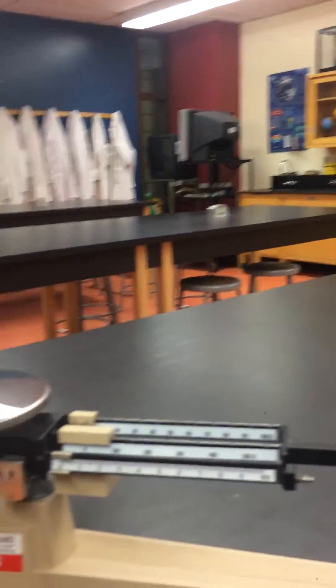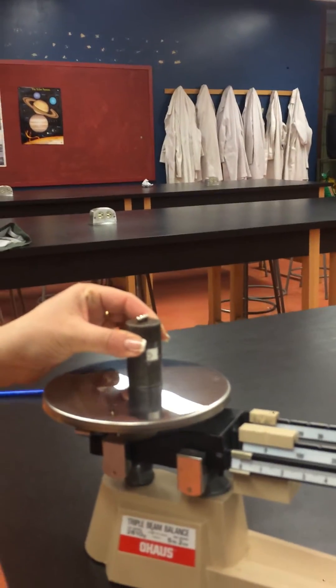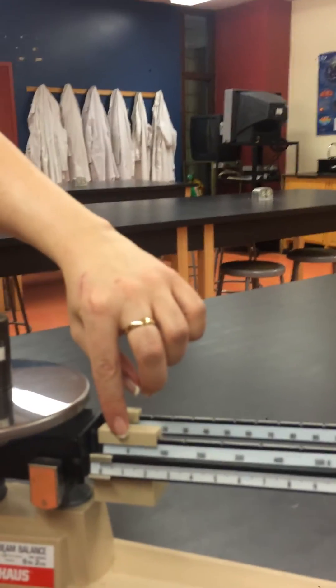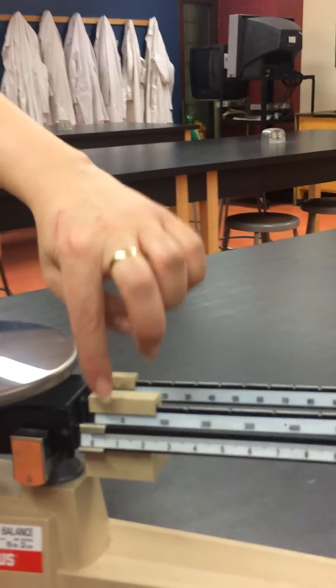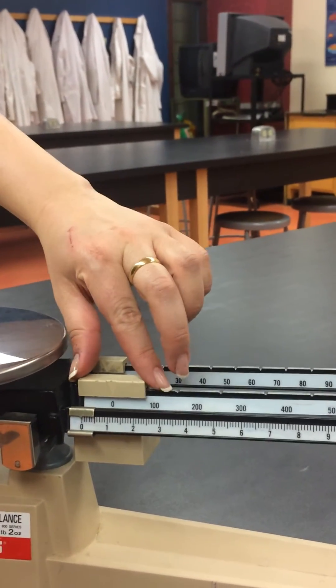Now carefully place your object on the pan. We always start with the hundreds, then the tens, then the units. So you carefully move your slider.